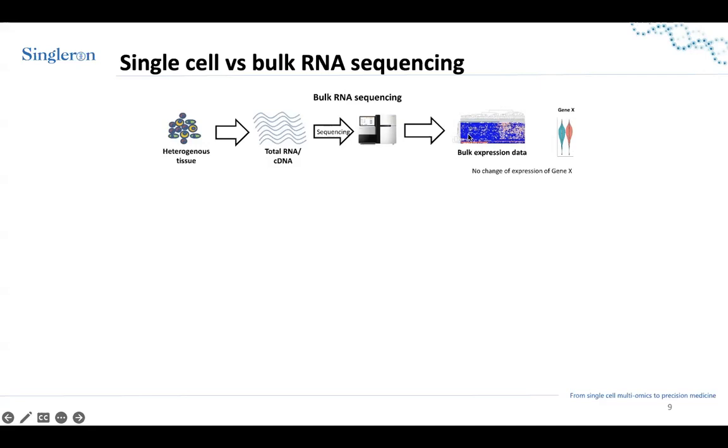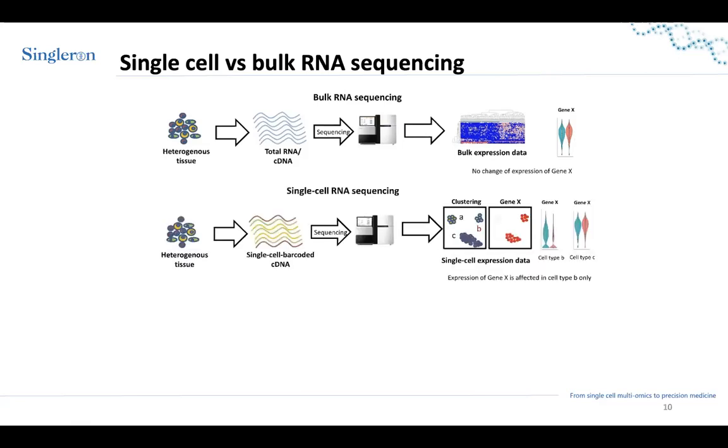Well, when I say sample 1, sample 2, I mean condition 1, condition 2, because the idea here is to have the same sample in different conditions to see whether there is a change with different conditions. And when you check the gene expression level for gene X for these two different cases, you might see that there is no change. It is possible you might also see that there is a change. Everything is possible.